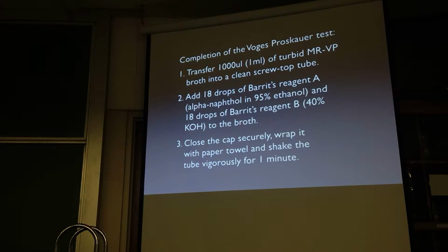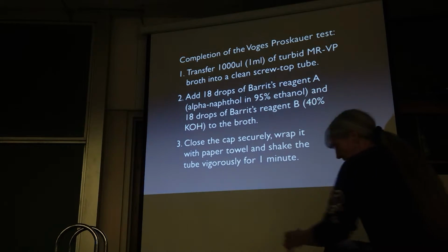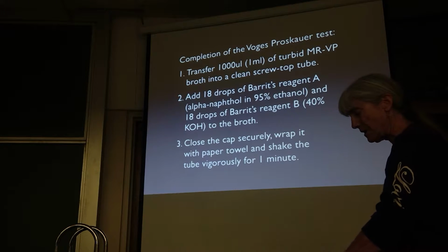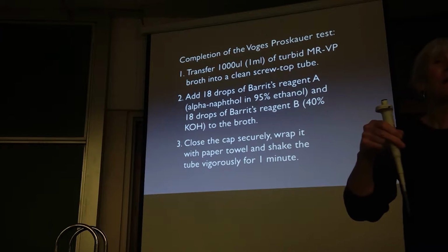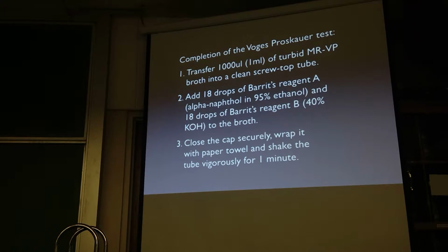Instead, you're going to use digital pipettes. I would like to keep these digital pipettes up front so that they don't just get randomly distributed around the lab. To use these, you have to put a tip on. To put the tip on, put the pipette in the tip and tap it, like you would tap a tiny little hammer. Don't stick it in the box and lean on it, because you might break it. When this tip is on properly, there's a gap here. Don't try to close it.